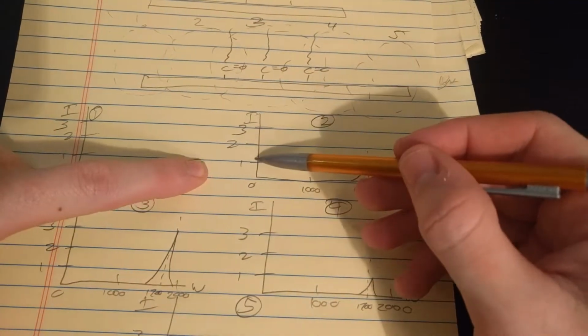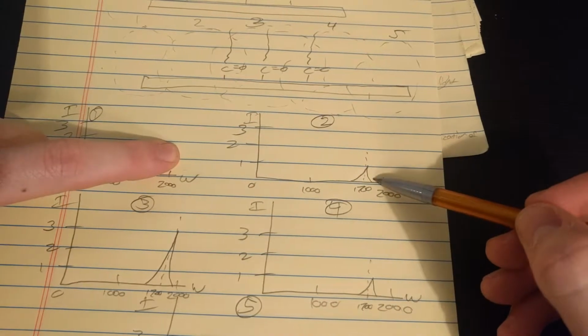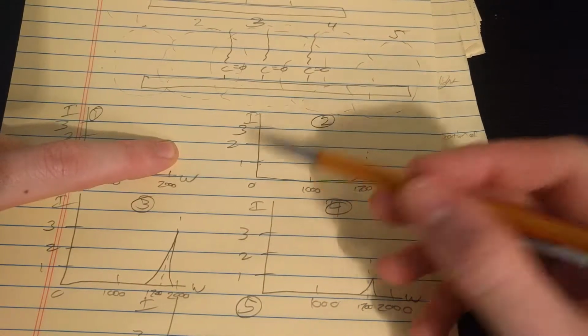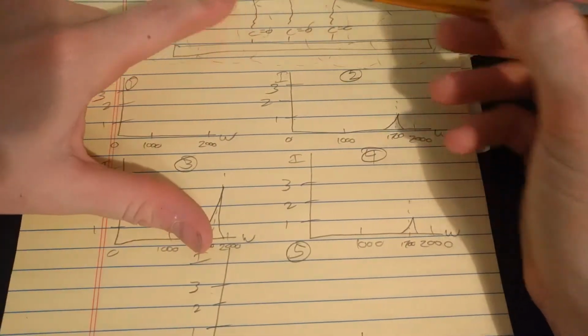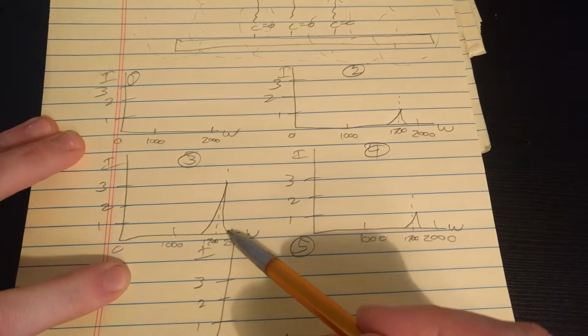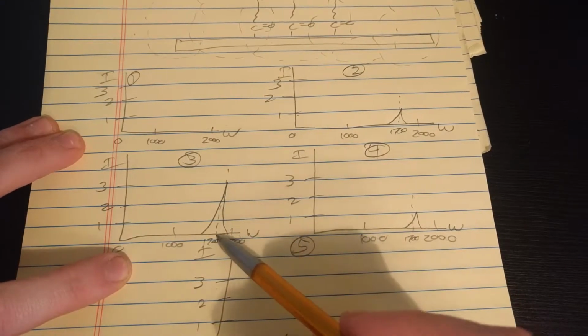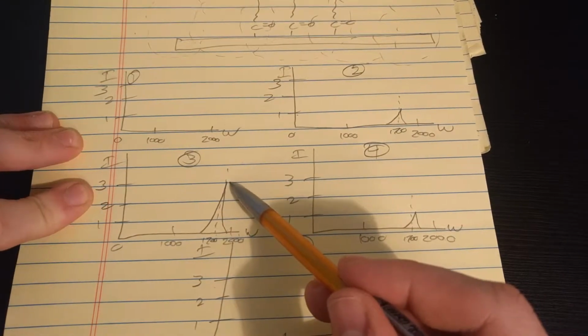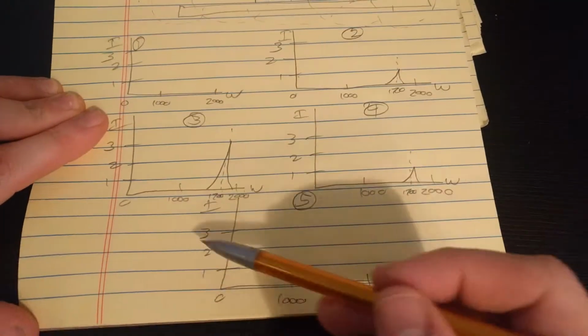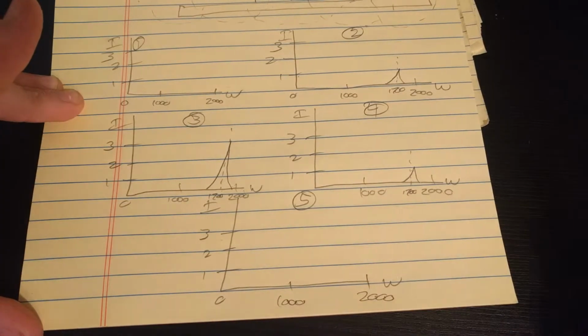So in some arbitrary units, our intensity of our carbonyl peak has an intensity 1. In spot 3, we have 3 molecules. So the carbonyl peak is, in arbitrary units, 3. And then with 4, it's 1, and 5, it's 0 again.